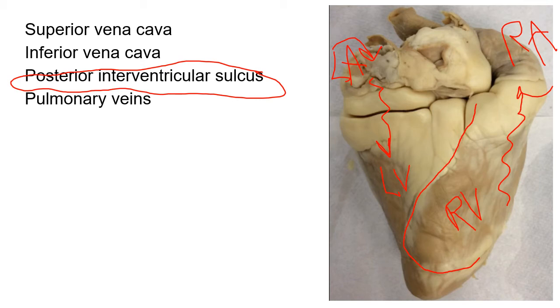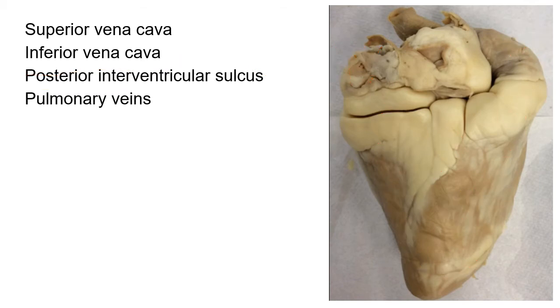Now, when it comes to the veins associated with the two atria, they can be a little tricky to see. They're going to look like mushy holes, almost like plastic grocery bags from the grocery store, whereas arteries are nice and big and thick-walled. So let's erase this and do our best to look at some of the vessels that are back here.